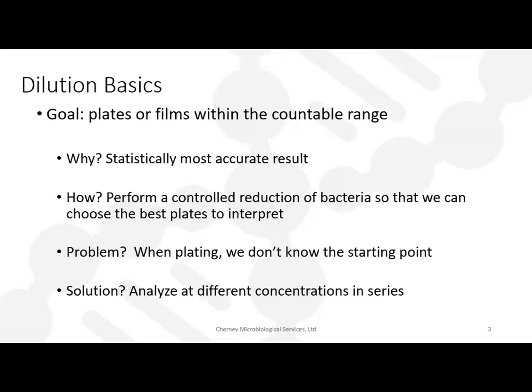If you don't do a dilution, you might have a plate that's covered in bacteria that would be too numerous to count. And having a result that's too numerous to count won't exactly be helpful for you to use for tracking and trending, or it won't give you a meaningful result for your product. So adding these dilutions in is going to give you the most accurate result.